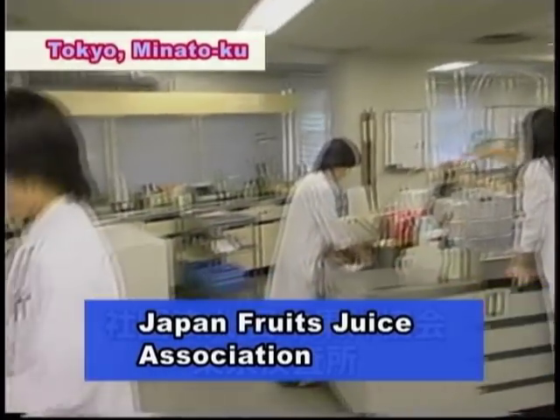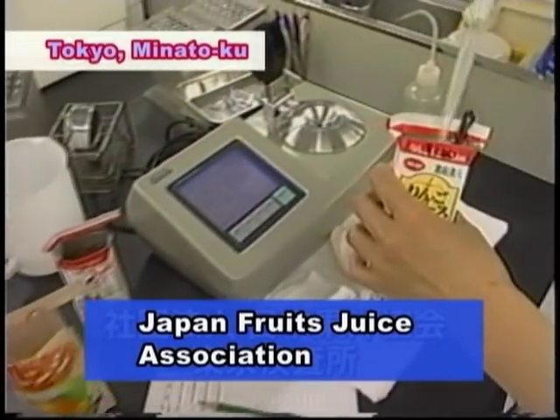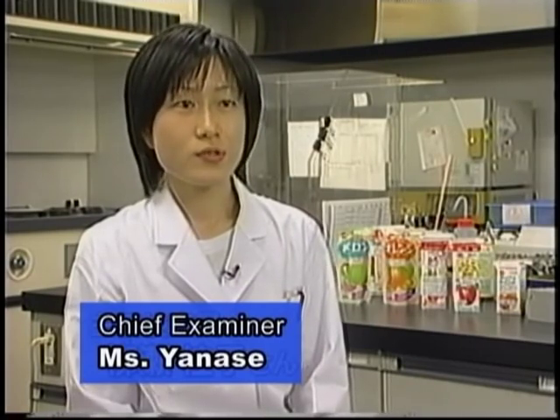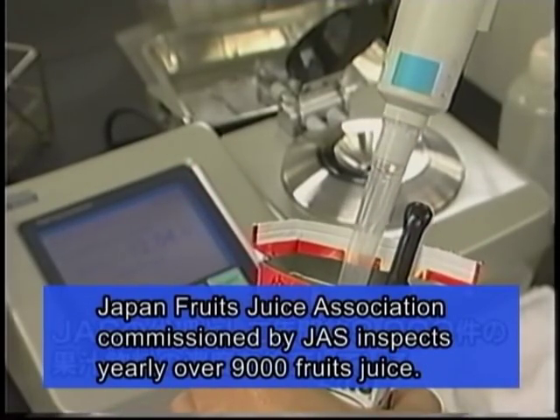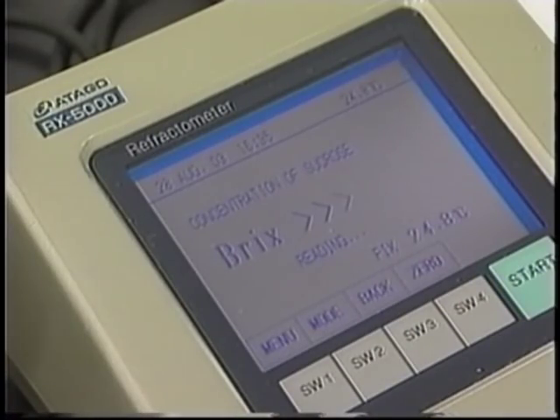The Japan Fruit Juice Association inspects the density levels of drinks and juices released each year with Atago's latest refractometer. We examine the densities of fruit juices produced by beverage manufacturers. By measuring product samples, we check whether density levels are properly indicated on the package. In this process, we use Atago's refractometer at an accuracy of 0.01%. As manufacturers only control their products' quality in units of 0.1%, for closer examination it is necessary to measure in units of 0.01%.